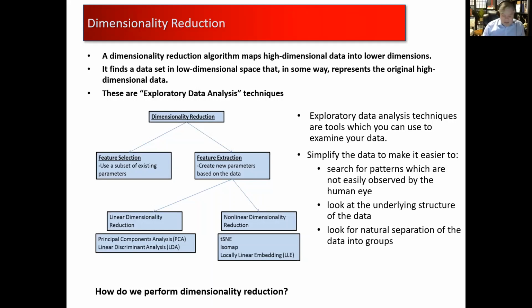That's a low dimensional data set, but it's got to represent the original high dimensional data set in some way. Now, I think the important thing to keep in mind is that generally when you're working with tools like t-SNE, these are exploratory data analysis techniques. They're not giving you any sort of empirical information about, these are the phenotypes that you're interested in, here's the cluster of that. They're not making any sort of determination of what you're actually looking at on that plot.